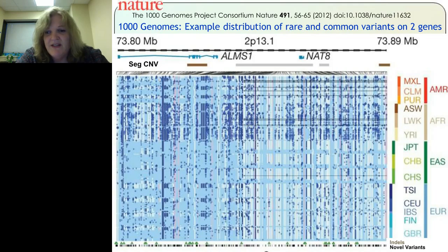So the genetic diversity, you can see, first of all, in African Americans, you have an awful lot of genetic diversity. And the reason you can see that is the little blue crosses, which look like little tiny blue specks on there, are rare variants with less than 5% in the population. At the bottom of the entire graph, you see little black tick marks. Those are novel variants that have not been seen before. The little green arrows below there show where there are indels found in each individual.